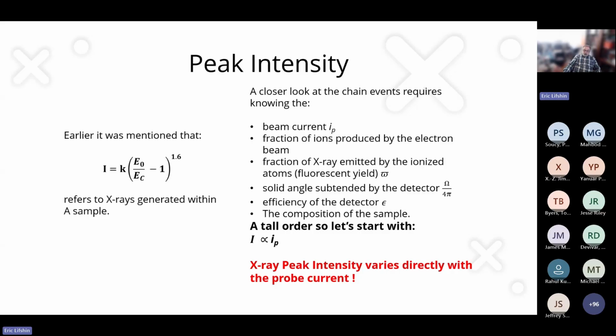The microprobes were typically running at currents that would even run up to a tenth or even 1 microamp. And I usually had 2 lenses rather than 3 in those early ones. And so, current was a big issue. If you don't have a lot of current, you don't have a lot of signal, your peak to background ratio goes away, not only for your X-rays, but even for your SEM images. So if you'd like to increase the current, that's good.